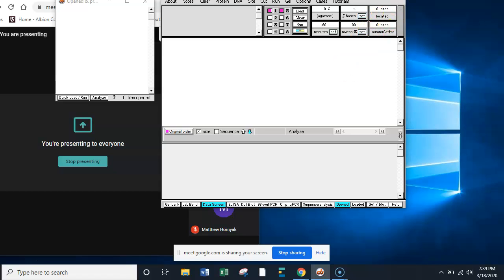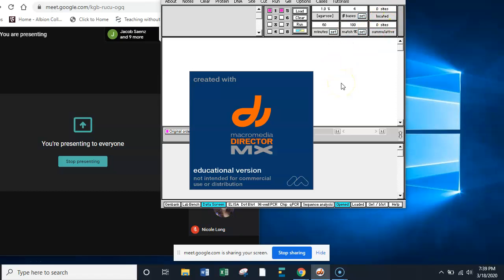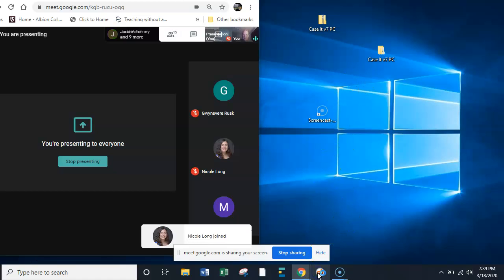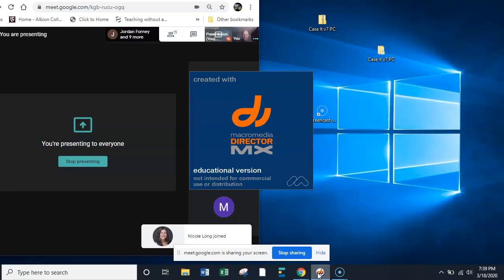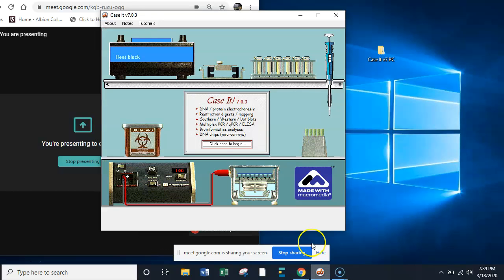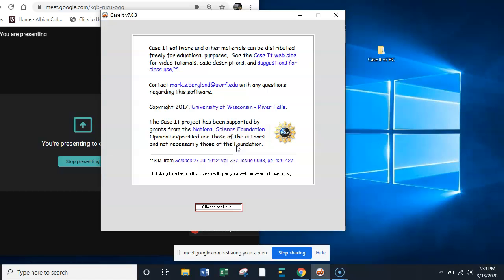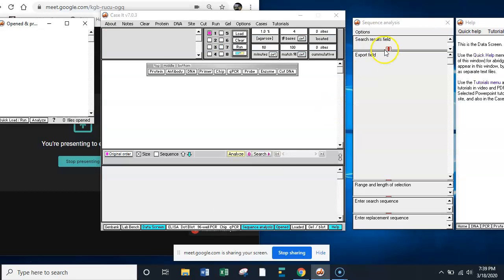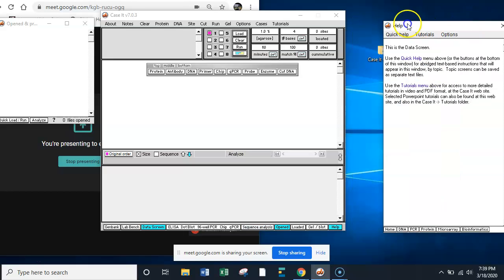All right, I'm just going to close it and open it back up and see what happens. But sometimes that thing hides. That's all I was trying to say. And you might have to go look for it. So I could just click back up here. Click to begin. Click to continue. Get rid of these things just so we have more room.